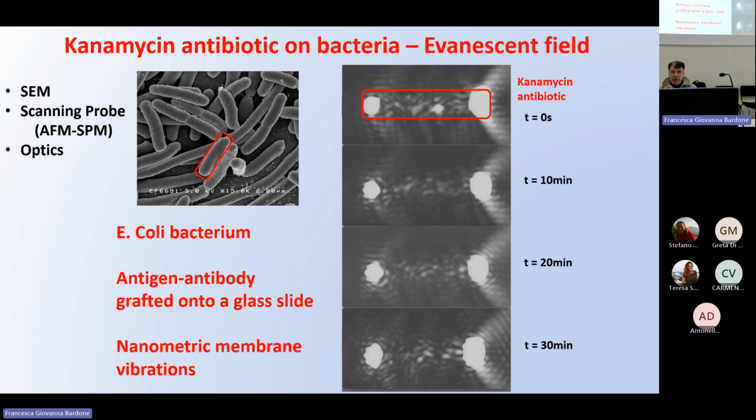It uses a very, very gentle probe that we will show you later, just to show you what we can do. And in this type of microscope, you can work in liquid and at very high pressure. So you can see how your bacterium behaves.